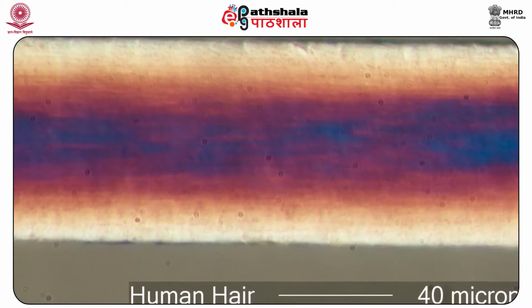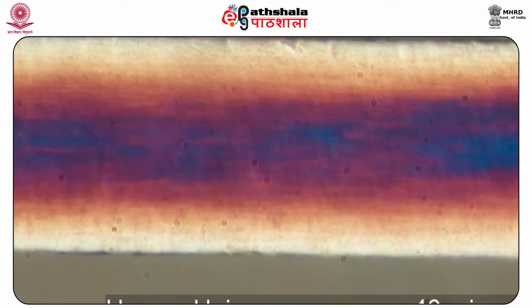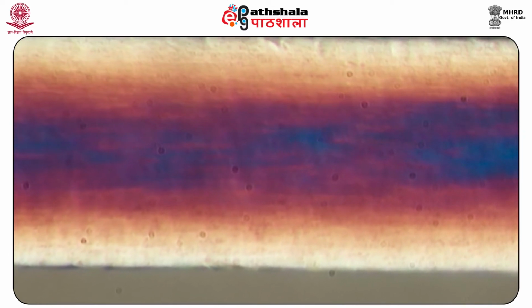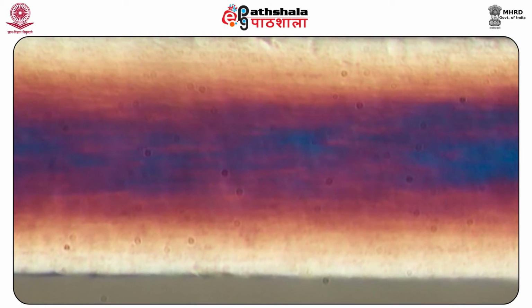The microscopic examination is conducted to analyze whether two or more individuals came in contact, or whether a person came in contact with an object. The value of hair evidence is related to the variability of hair characteristics between individuals and populations, which can be visualized through the use of the comparison microscope.